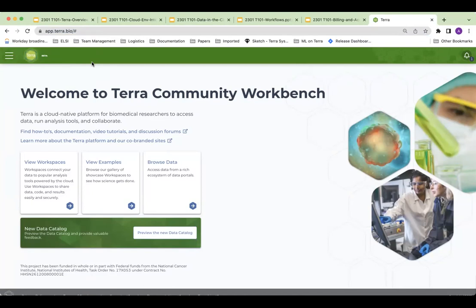Anton, I just have a question for you. I am starting at ground zero. As you know, I've been working on the DDP side, so all of Terra and all of this is very new to me. I had a question on the slide that talked about data sets, collaborating, and then workflows and interactive analysis.